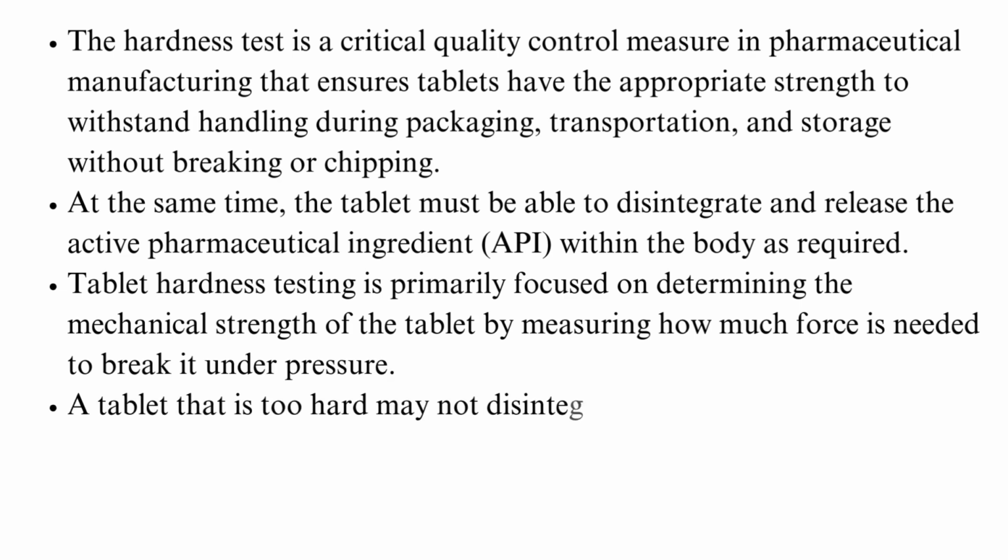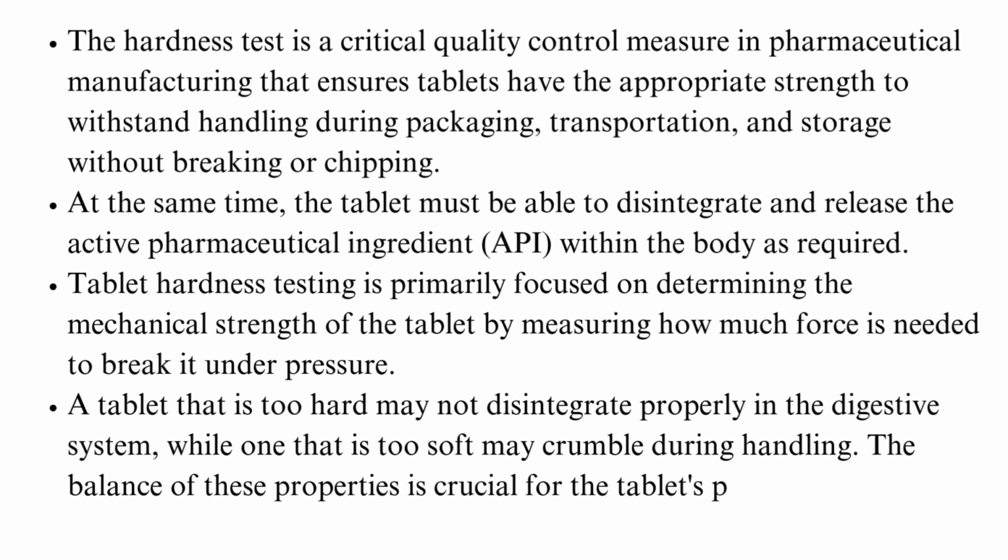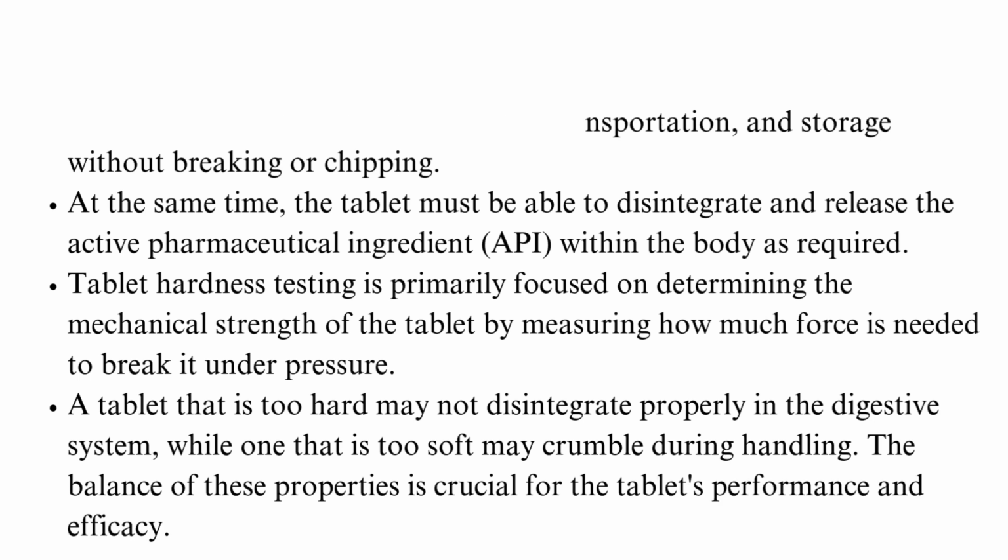A tablet that is too hard may not disintegrate properly in the digestive system, while one that is too soft may crumble during handling. The balance of these properties is crucial for the tablet's performance and efficacy.